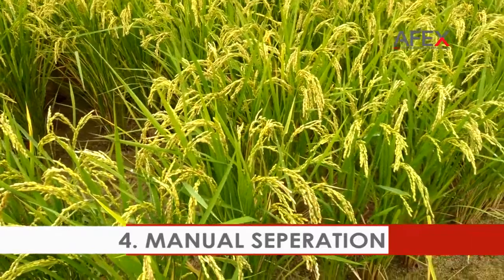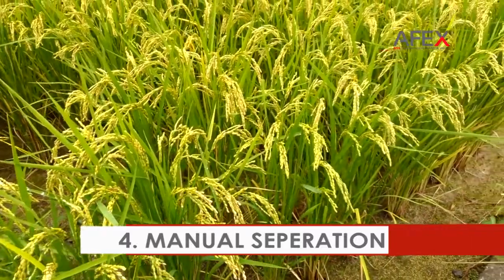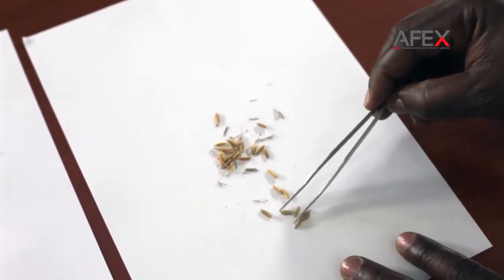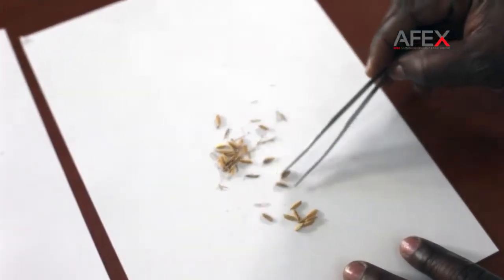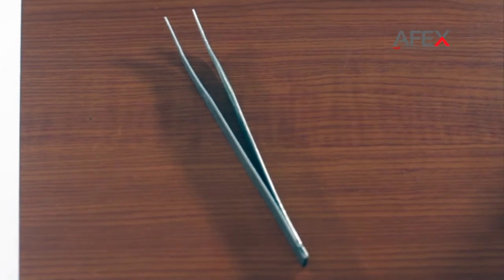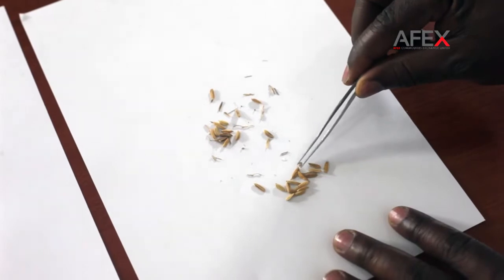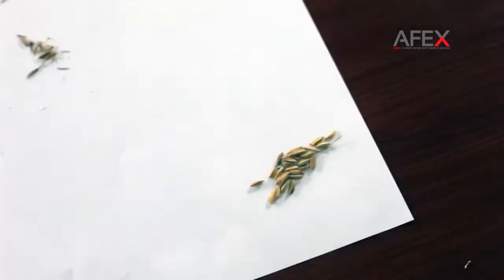Manual separation. Manually pick out organic and inorganic foreign matter that did not pass through the sieve using the pin set, also known as tweezers. Organic foreign matter includes immature and empty kernels of paddy. Inorganic foreign matter includes other dirt or stones.